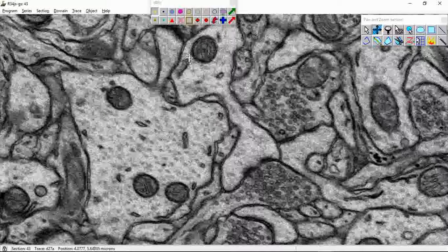And what we want to do is grab and click our protrusion stamp, and we will click on the stamp shape tool on the top here, and we will denote the protrusion origin, which is where it first connects to the base of the dendrite, by stamping it where the shaft of the dendrite connects to the protrusion neck.